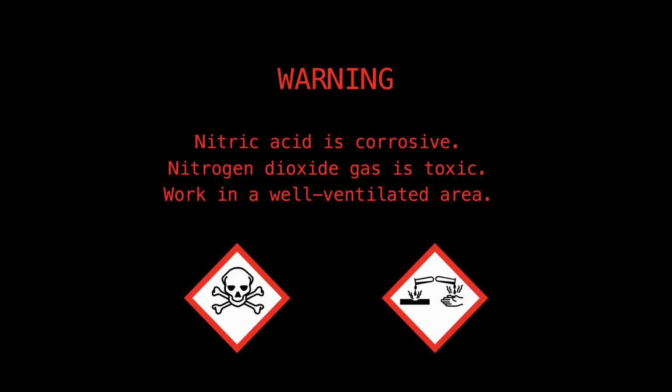Warning: nitric acid is corrosive. Nitrogen dioxide gas is toxic. Work in a well-ventilated area.